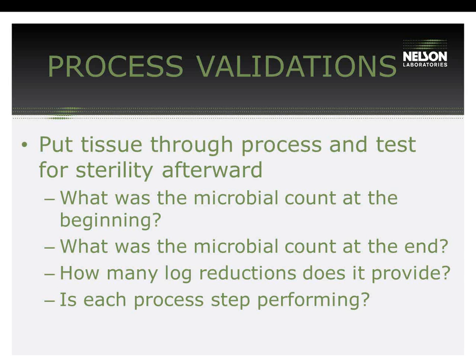But for any that have growth on them, you have no idea whether that was growth due to one remaining microorganism, or it could be 1,000 or 10,000. You have no idea what that final microbial count is. And without a starting count and without a final count, you cannot determine the number of log reductions. And that means that you really have no idea what the microbiological capability of your process is. Also, when you put tissue through the entire process and test for sterility, you also don't understand what each step is providing.